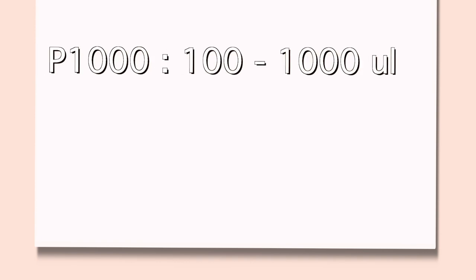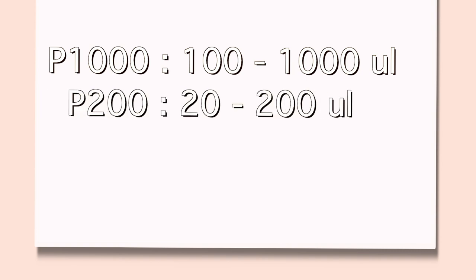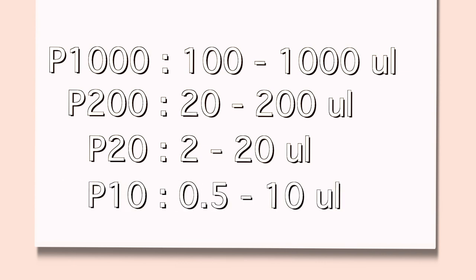For the P1000, the range of liquid volumes is between 100 and 1,000 microliters. For the P200, the range is between 20 and 200 microliters. For the P20, the ideal range is between 2 and 20 microliters, while the P10's range is between 0.5 and 10 microliters.